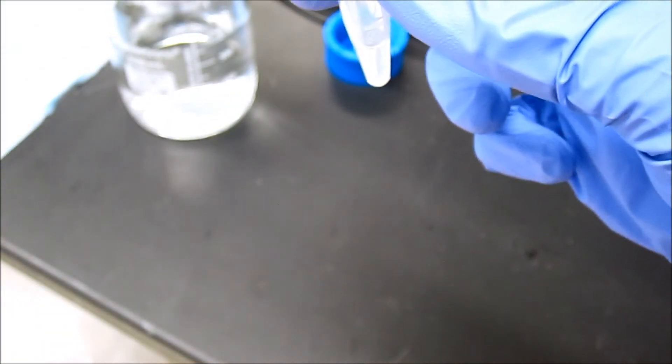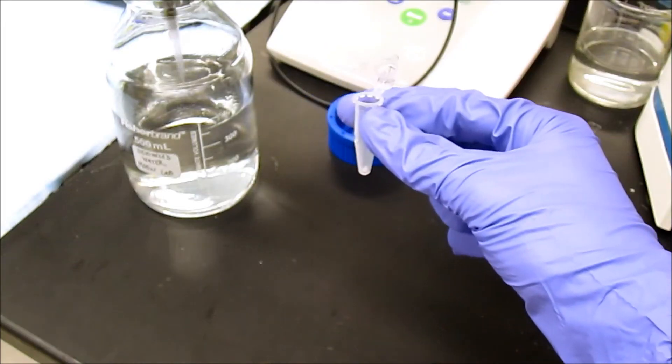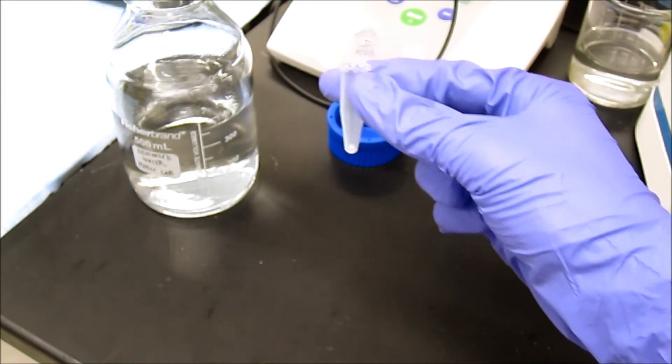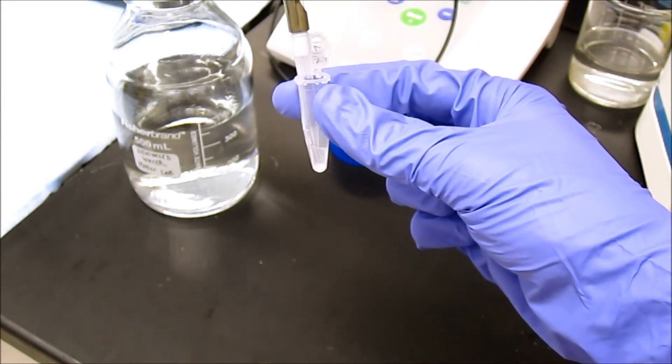After the initial centrifugation, the remaining solution called a supernatant needs to be removed from the pellet. The pellet is then re-suspended in 200 microliters of deionized water. The solution should again appear cloudy.